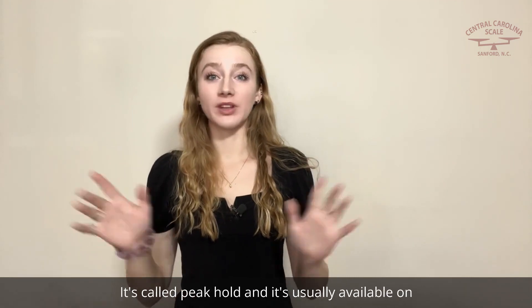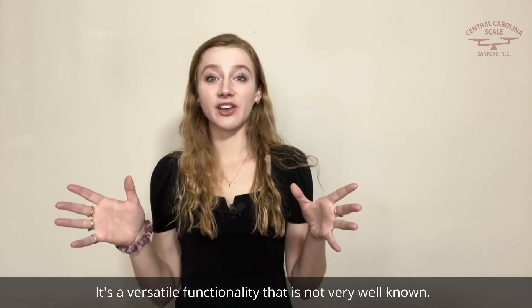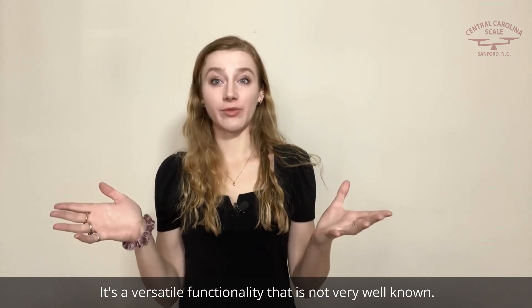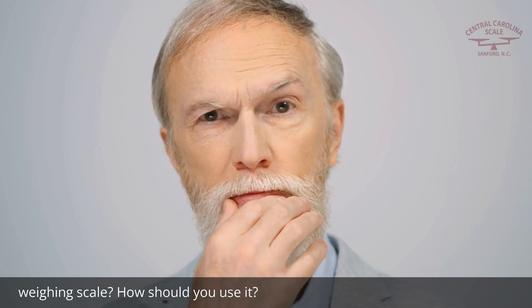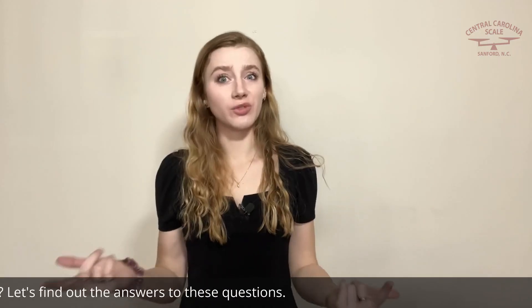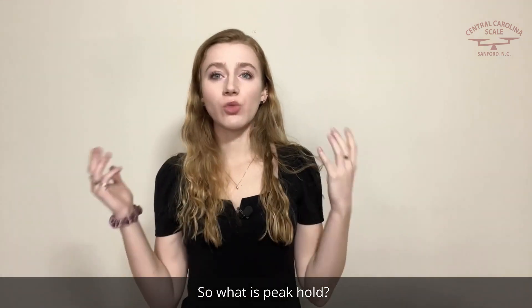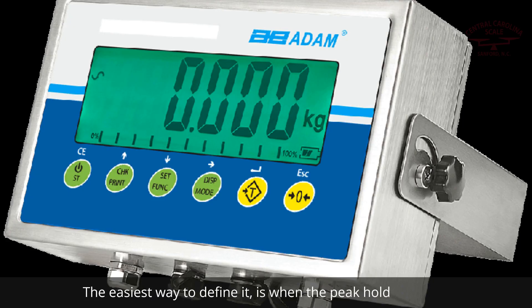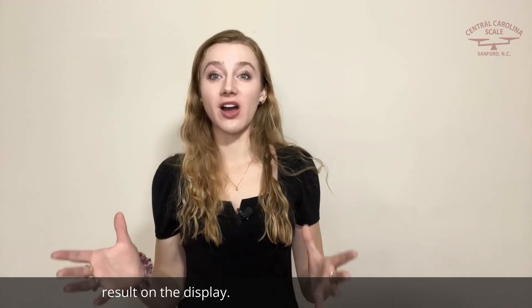It's called Peak Hold, and it's usually available on everything from floor scales to analytical balances. It's a versatile functionality that is not very well known. But what does Peak Hold do? Why is it useful on a weighing scale? How should you use it? Do you need it? Let's find out. So what is Peak Hold? The easiest way to define it is: when the Peak Hold function is activated, the scale records the highest reading detected by the scale or balance, and holds the result on the display.